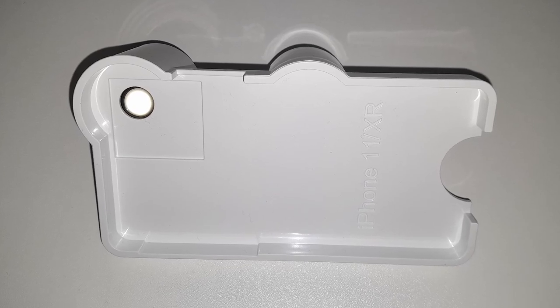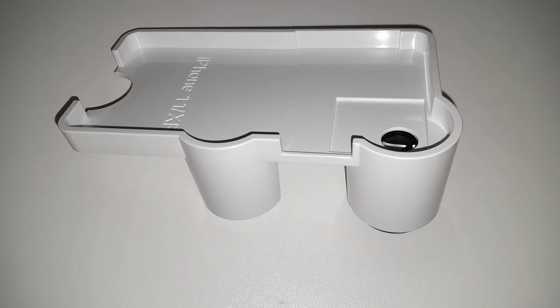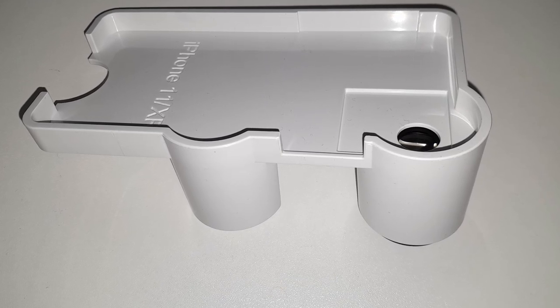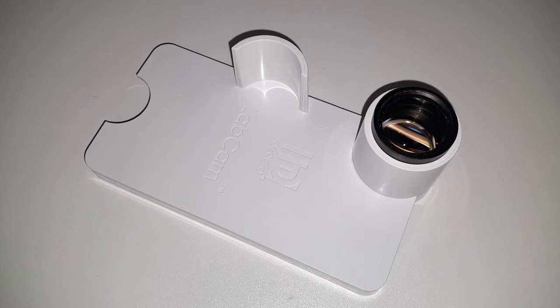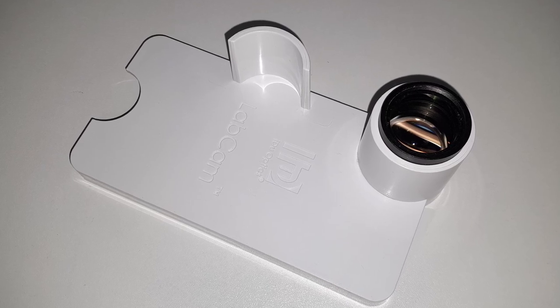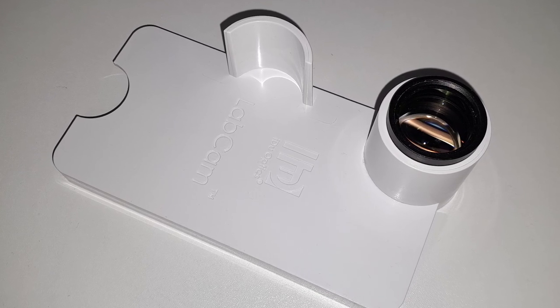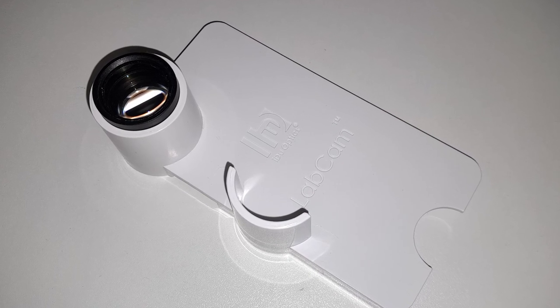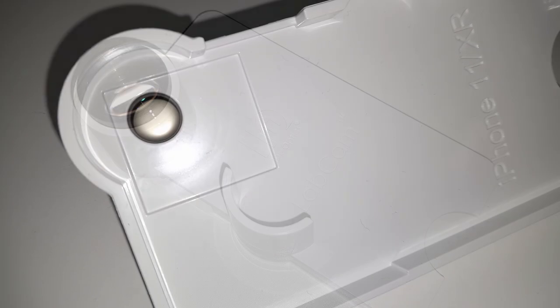So let's have a few closer looks at the adapter here. It is made of solid plastic with the exception of course of the optics and therefore because it's so solidly built of course there's no danger of the mobile phone falling out of the adapter.